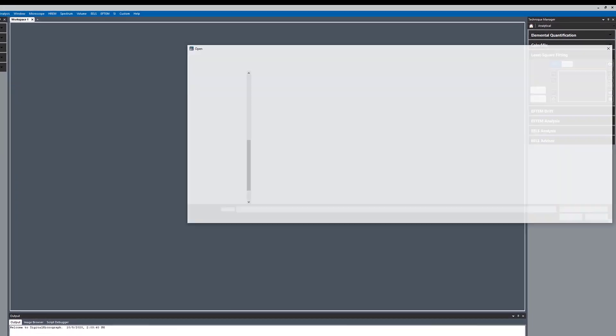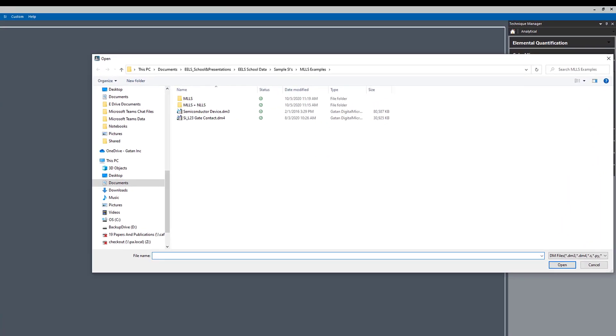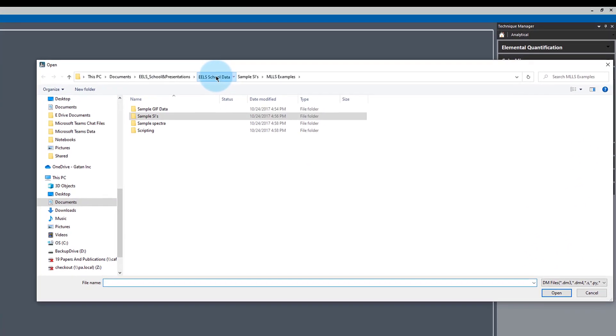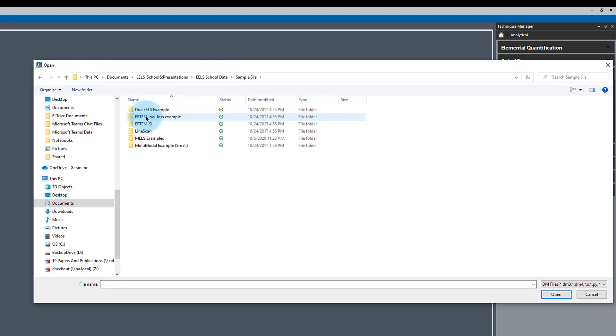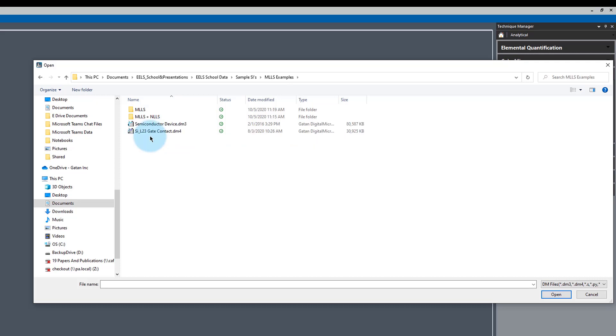Go to File, Open, and under EELS Data, Sample SIs, MLLS Examples, Silicon L23 Gate Contact.